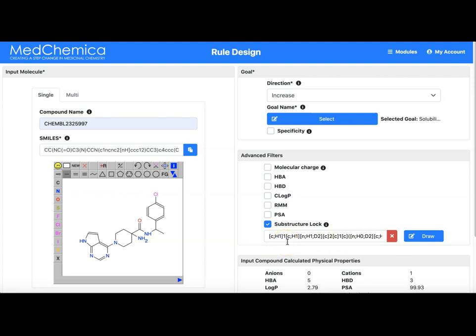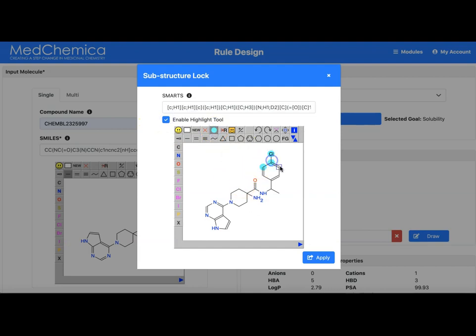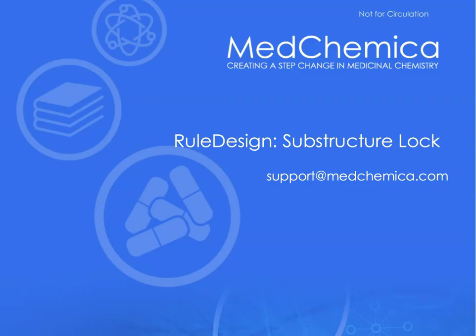If we want to change the substructure lock we can press the red button which clears it, and go back into the draw button and we are then free to draw again. We might want this time to change only the ring and not the linker. So that is how we use the substructure lock — an explanation of how to use the final advanced filter, the substructure lock, for a rule design rule.